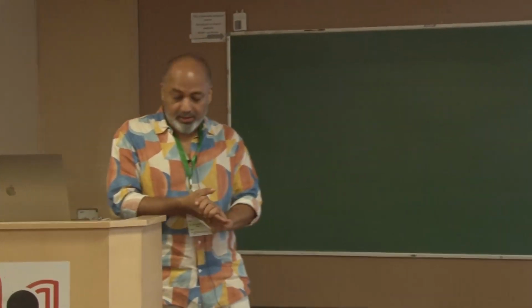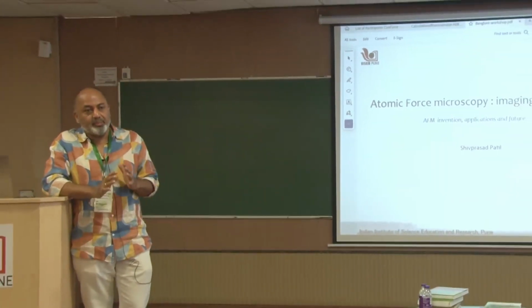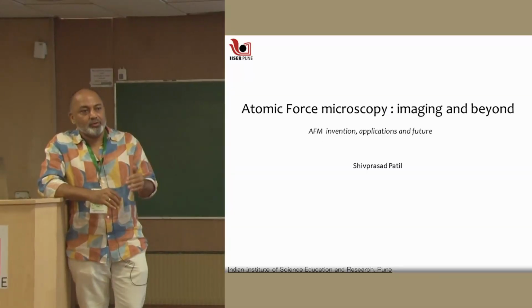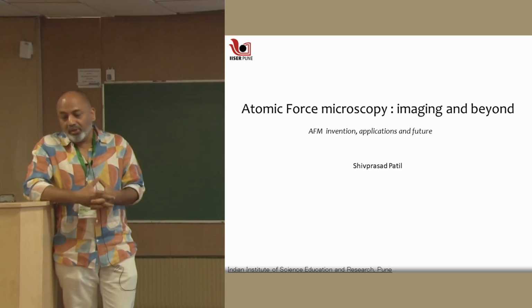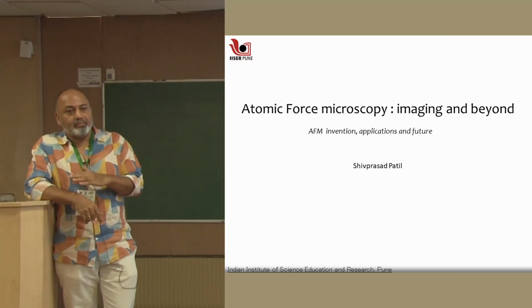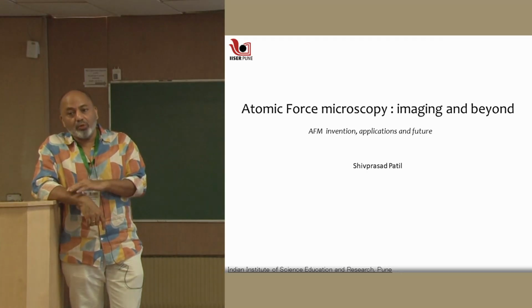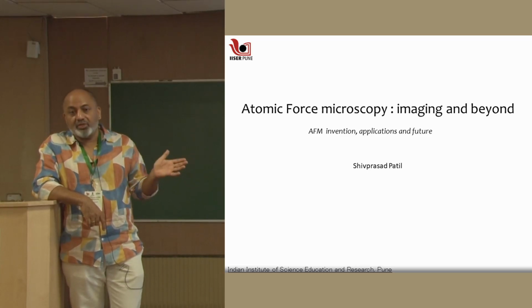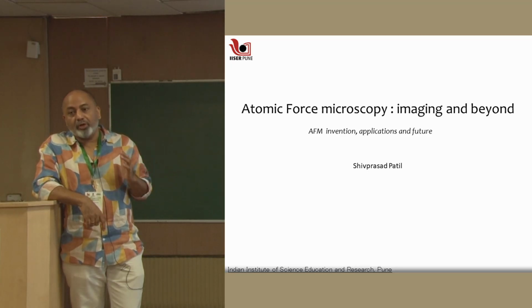This one I have titled as Atomic Force Microscopy, Imaging and Beyond, because this talk I always keep ready for many workshops and schools, wherever I need to introduce AFM as a tool. So this will also cover some bit of history of AFM and also various imaging modes. And beyond imaging, particularly in life sciences, imaging, yes, of course, is important, but single molecular interaction using atomic force microscope is something beyond imaging.